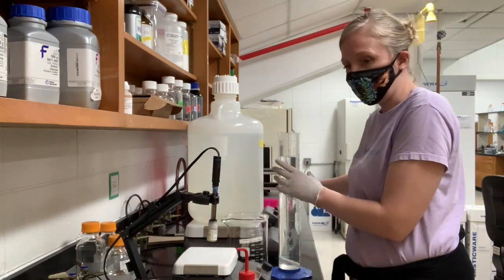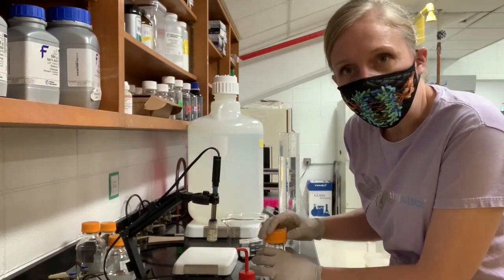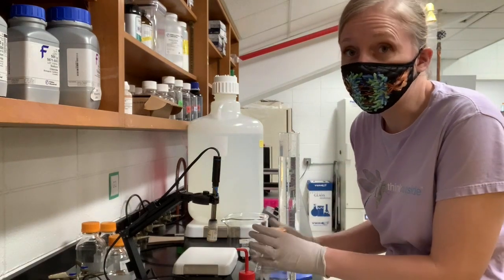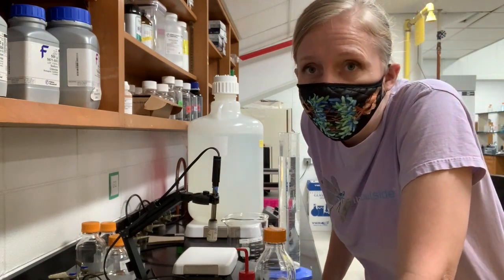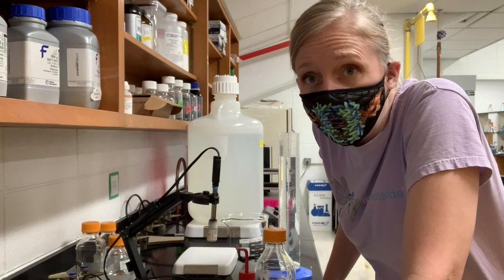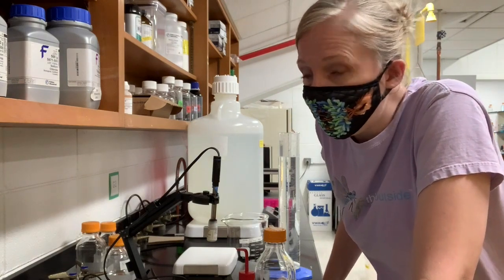So I have my solution up in 1 liter. Often people will ask, well, is the pH still the same? And you can check it if you want, but because water is neutral at 7, and because you're adding it to a buffer, and a strong buffer at that, that's concentrated, the pH is not likely to change very much.